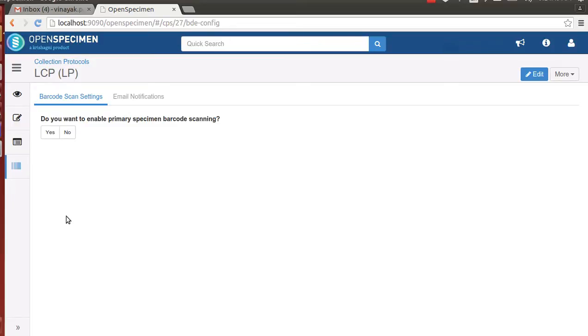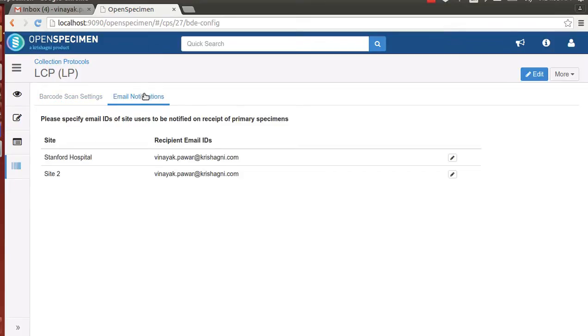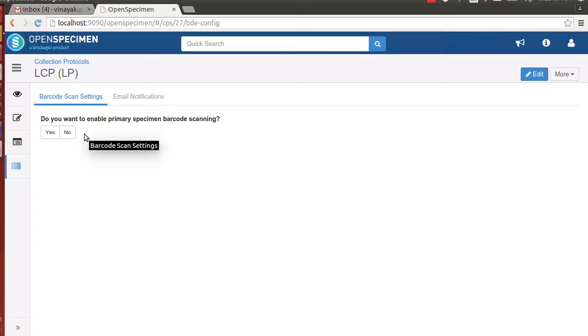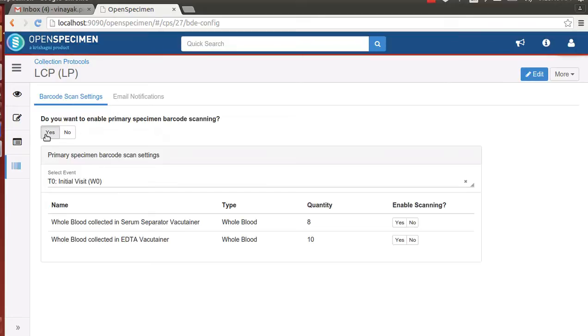It has two kinds of settings: barcode scan settings and email notifications. The barcode scan settings specifies whether the primary specimen label needs to be scanned. In our demonstration, we did not scan the primary specimen labels and they were supposed to be collected automatically. You might come across studies where some of the primary specimens might not be collected. In which case, you might want to say yes, we want to enable primary specimen barcode scanning as well.